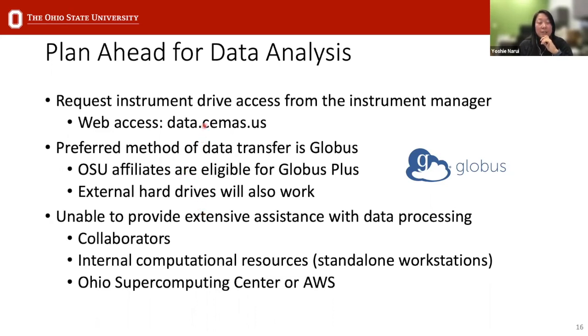And those you can save onto your instrument drive here at CEMAS. If you need your own instrument drive folder, which I would recommend all new users get, you can ask us to have that set up for you. Then you can access the instrument drive folder through this website here. That works well for very small snapshots, individual images of grids. But once you get to the point that you have actually done a data collection, you're probably left with terabytes of data, let's say a couple terabytes. That's not something that we can put on our instrument drive for you to access through the web.